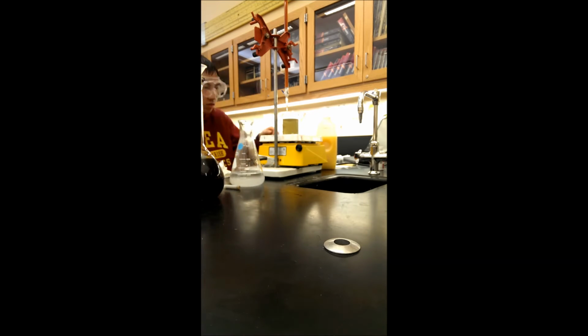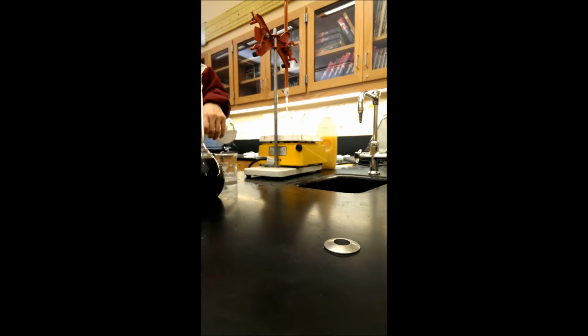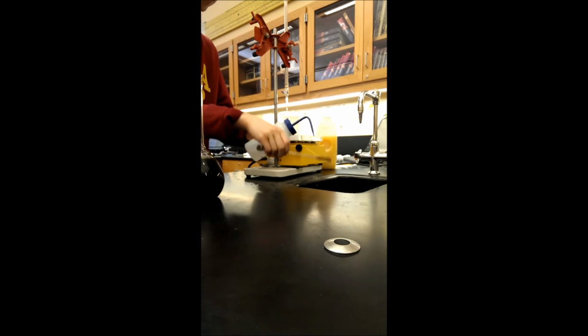And so doing some ridiculous calculations there, it turns out that I calculated there's about 2.66 grams of vitamin C in the entire orange juice container, which is 1.8 liters. And I was expecting, based on the nutrition facts, 576 milligrams of vitamin C. So I had an error of 362%, which really isn't too bad considering all the errors from measuring all the different substances. So not too bad there.